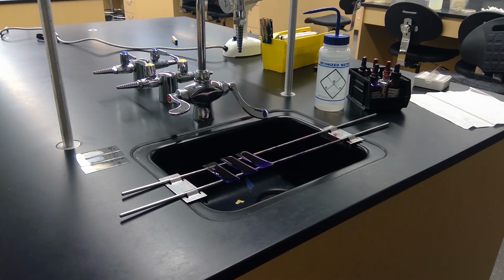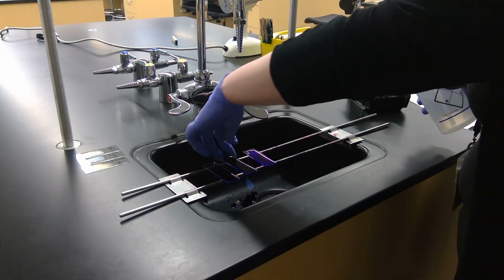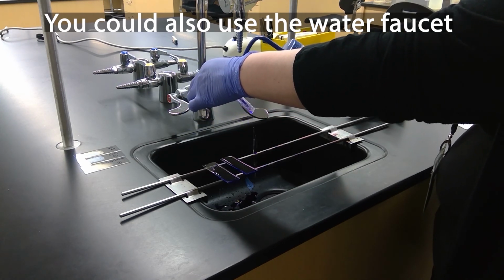Alright, it's been a minute, so now we'll move on to the next step. It says, gently rinse the excess crystal violet from the slide with cold running water. So just rinse it.